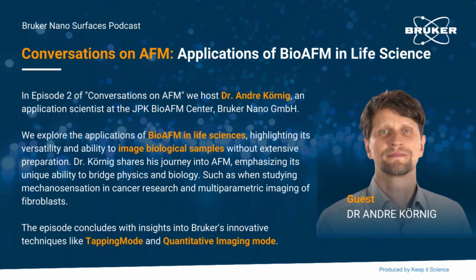His focus is on biophysical applications of atomic force microscopy, or AFM, as we will be referring to it later on, such as imaging of single cells and biomolecules, dynamical studies using high-speed AFM, and nanomechanical analysis using force indentation and microrheology. So first, a huge thanks, Andre, for being here with us today. And maybe you could introduce yourself a little bit to our listeners and tell us who you are and what excites you about AFM technologies.